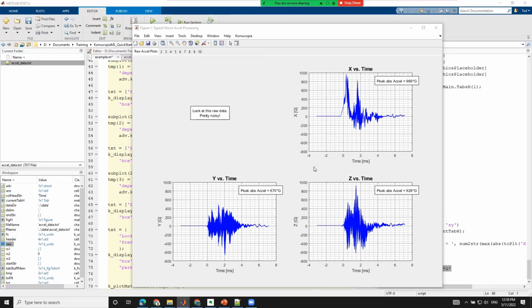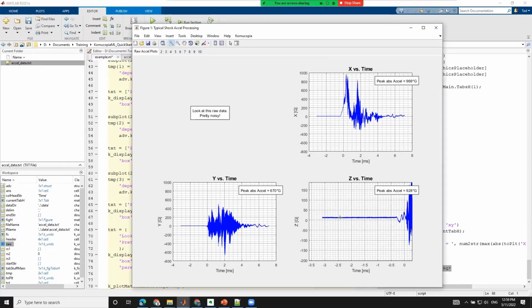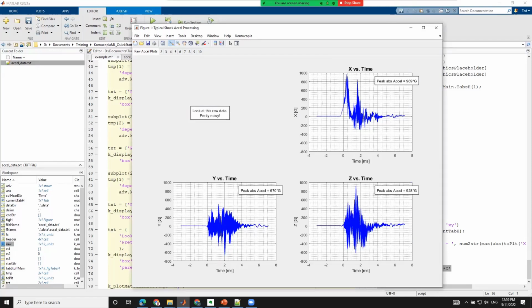All right. So if we look at this data, even though somebody might have tried to zero everything out before the measurement, we can see it's not truly zero. You can clearly see it here, especially if I zoom in. The zero line is here. The data is not really truly zeroed. So if we were to integrate that, we would get a distortion. We want to remove that out of the data. I'm just right-clicking to put that back.